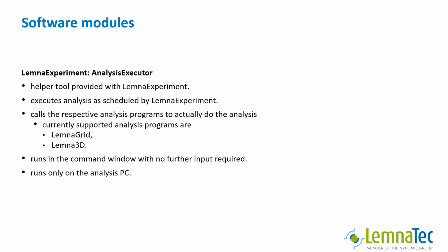Now we have to mention one additional tool associated with Lemna Experiment, the Analysis Executor. The Analysis Executor is a helper tool provided with Lemna Experiment. It executes the analysis as scheduled by Lemna Experiment. In order to do so, it calls the respective analysis program to actually execute the analysis. Currently, only Lemna Grid and Lemna 3D are supported, but more options might be added in the future. The analysis executor runs in a command window without a graphical user interface. It requires no further input besides being started when needed. The analysis executor runs on the analysis PC.